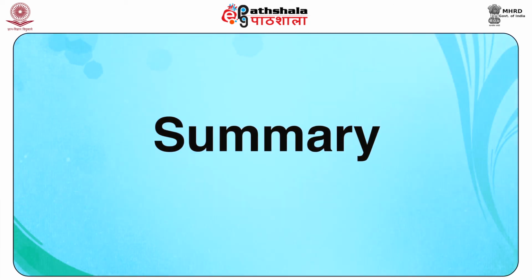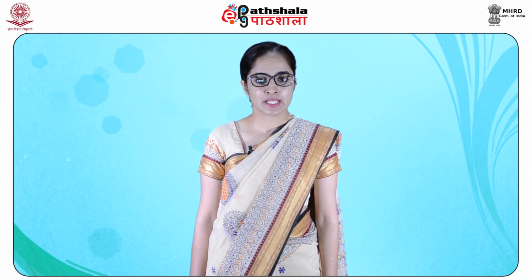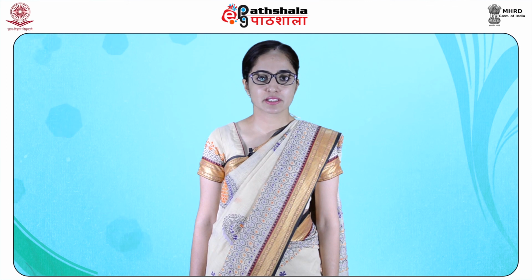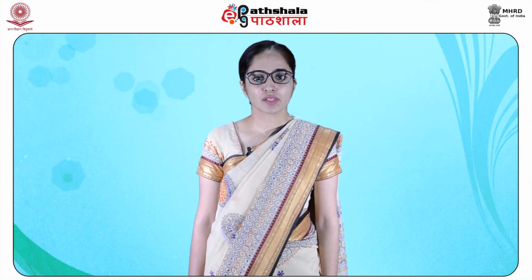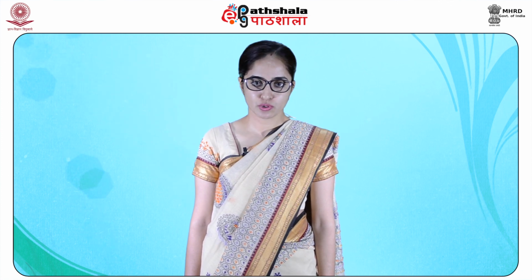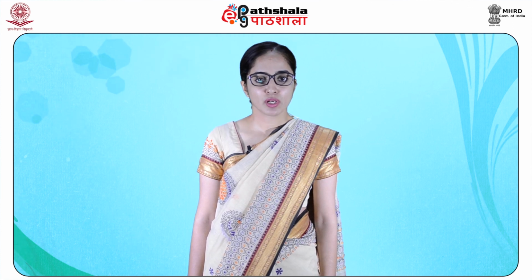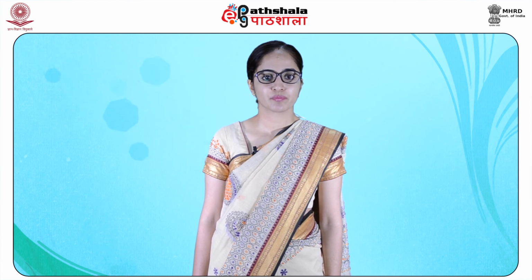Now, students, let us summarize this module. The intensity of the peaks in case of simple splitting is according to Pascal's triangle. Various factors like non-equivalent protons, close chemical shifts of coupled protons and presence of a chiral center in a molecule lead to complexity in an NMR spectrum.